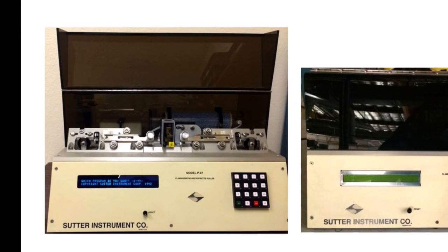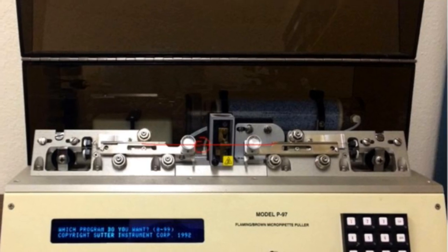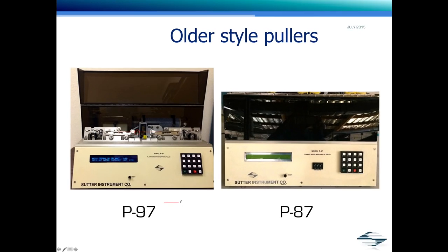Another thing you can do, which is kind of helpful: put a piece of glass in this puller bar so it's poking out about this far, I hope you can see this, and put another piece of glass in this one going all the way through to the other side. You can look here and see if the glass is aligned perfectly. You want both pieces of glass perfectly aligned when you look at them at the horizon and when you look from the top, looking straight down. If they're not aligned perfectly, there could be an issue with the puller bars being bent or the panels here being offset somehow. So it's a very hard thing to describe and fix via phone.